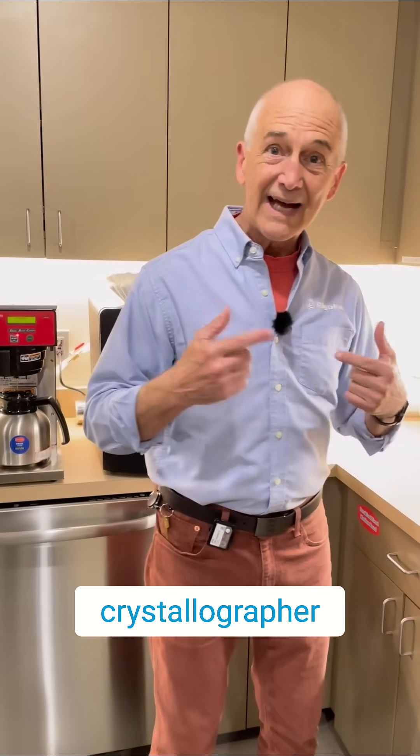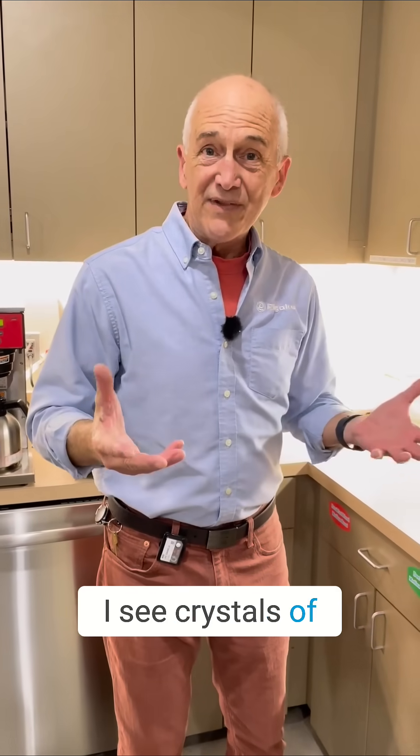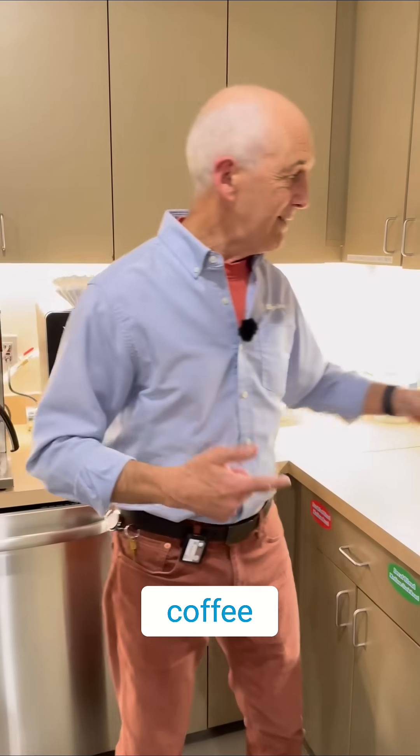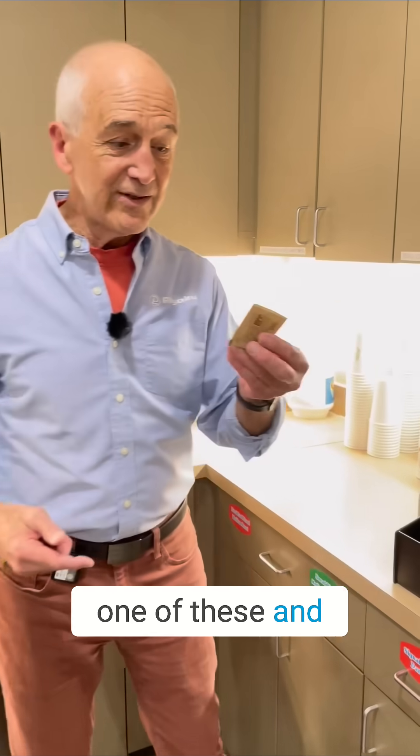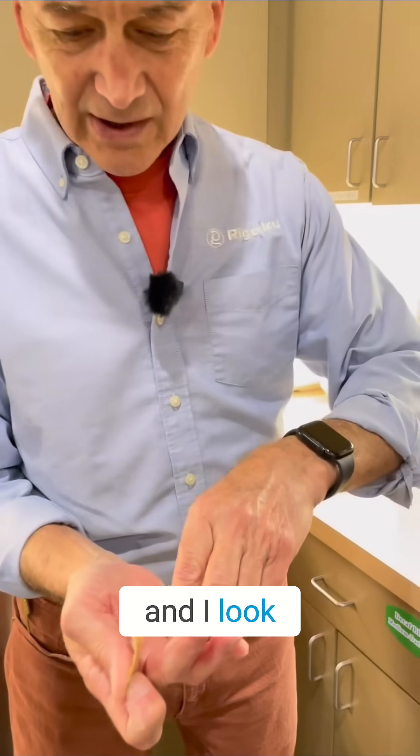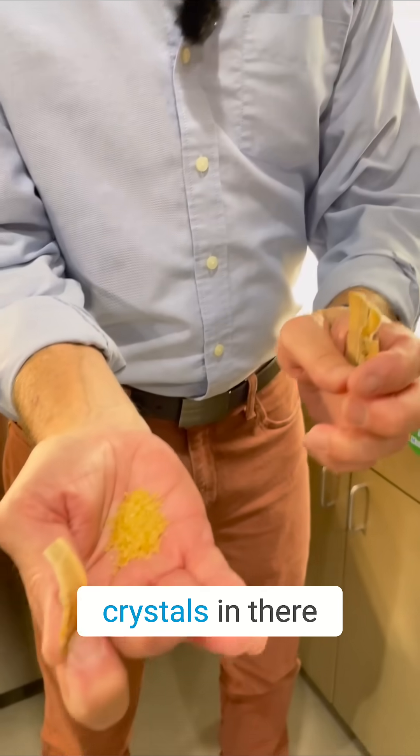Hi, because I'm a crystallographer, I get excited when I see crystals of things. So when I'm making coffee, sometimes I pick up one of these and there's sugar in there. I open it up and I look, look at that, there's a bunch of crystals in there. So we can learn more about that really easily.